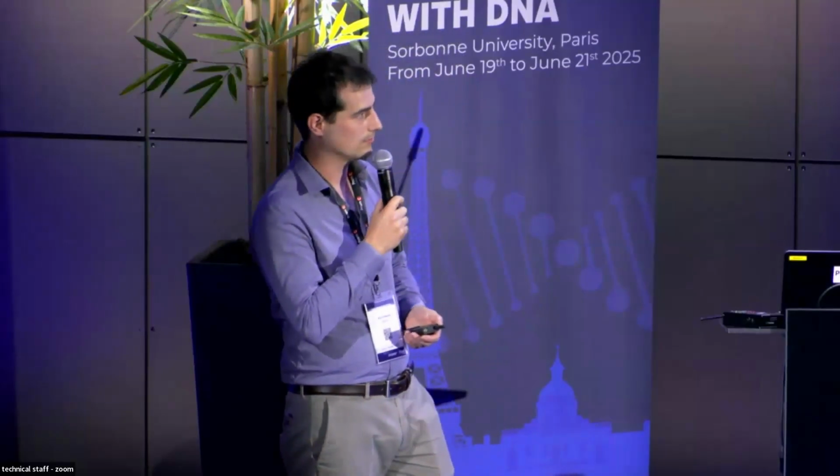No, that's definitely true. My experience is that, so we use platinum electrodes, they will randomly decay over time. It's difficult to make them stable. Definitely something that needs to be addressed in the future, but it's not exactly the focus here. It's been a frustration for us as well. Reusing the same device is convenient, and if you can't, then, these things are all handcrafted, so you run out of devices quickly, and it's not nice.